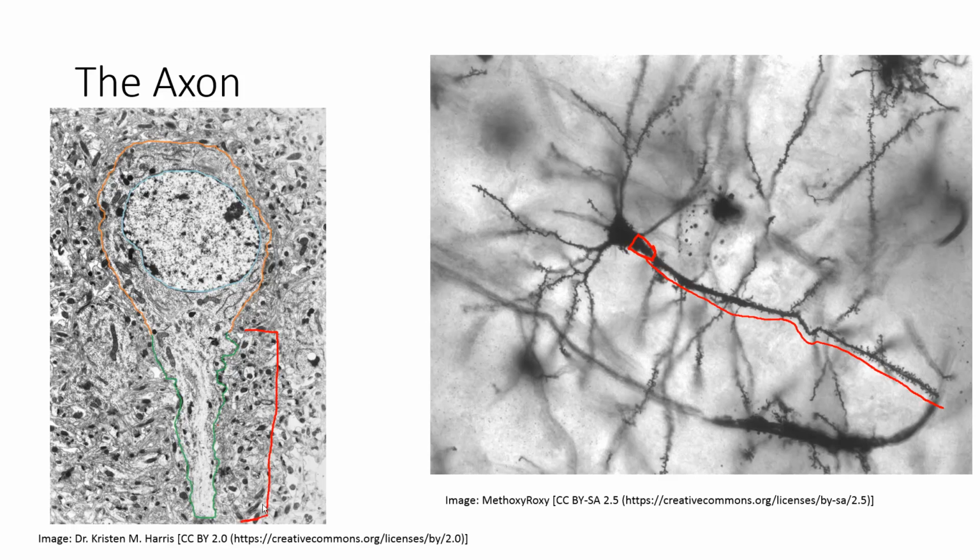It's not really super important, but the initial segment is just the axon hillock and the proximal portion of the axon. And you'll notice that in the axon hillock, we don't see any Nissl bodies. So here is a TEM of a Nissl body. Here's some Nissl bodies up in here, but we don't see any of those here in the axon hillock, so that's a good way to spot it in addition to its shape.